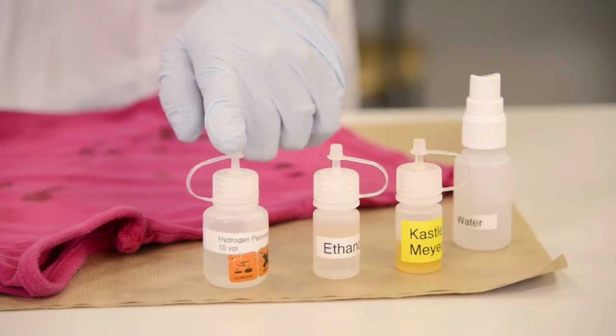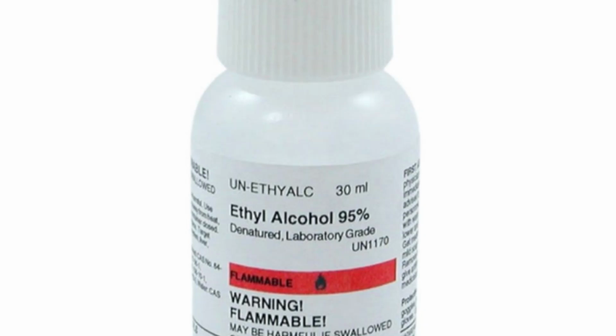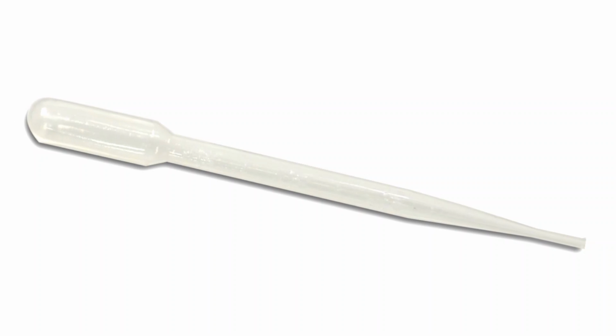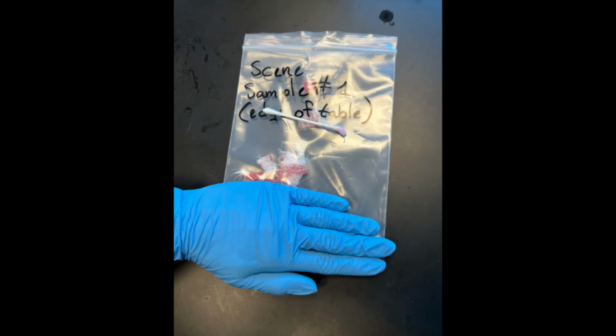Meaning if the cotton swab contains a pink color at the end of testing, then the sample was positive for blood. Here is a list of the materials we used to conduct the Kastle Meyer test. Cotton swabs, 95% ethanol, distilled water, pipette, phenolphthalein solution, hydrogen peroxide, blood samples.